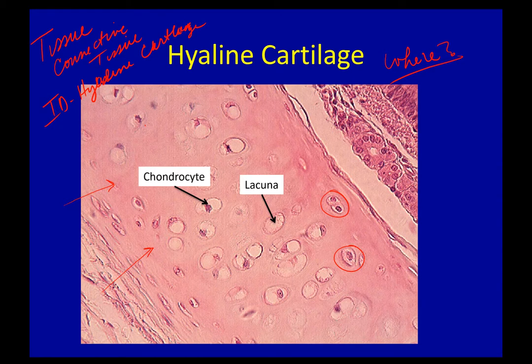So you have to make a space for a cell to sit in and then build around that cell. That space is called the lacuna. Here in this specific picture, you'll notice there's a space here. It looks like there should be a cell there, but there's no nucleus, so there's no cell actually sitting in that space. All you have is the cradle or the crib.